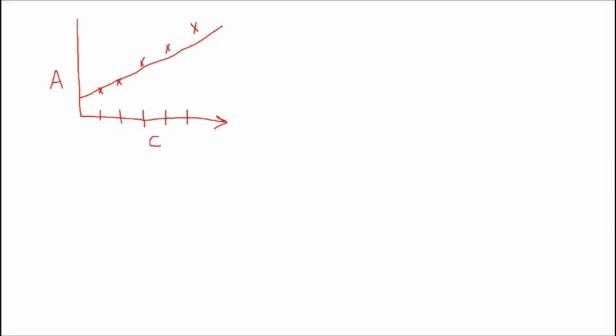जब हमने linearity देखा था in validation methods, first thing about linearity is to observe it. Observe the graph. If visually you think that linearity may exist between two parameters, you can check it statistically and mathematically. But first you have to see visually. So here visually, yes, there is linear between concentration and absorbance, these two variables. There is really a relationship between concentration and absorbance.